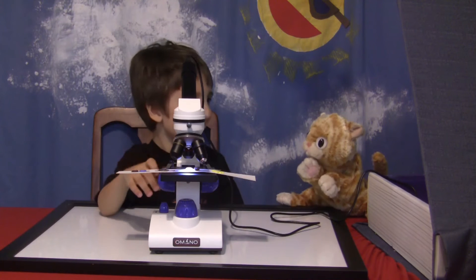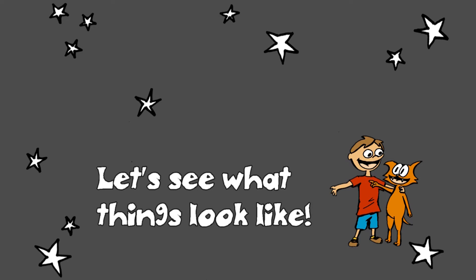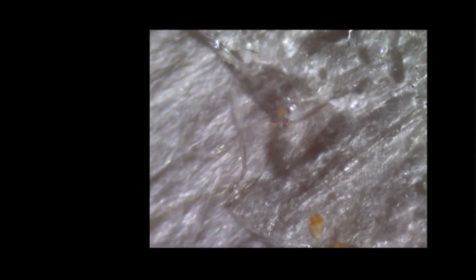Let's look at something else. That's the raisin right there. You got a good picture. How about something else? What else do you want to get next? Wait, is that glitter or is that paper? That's paper. Okay, let's get a picture of paper.